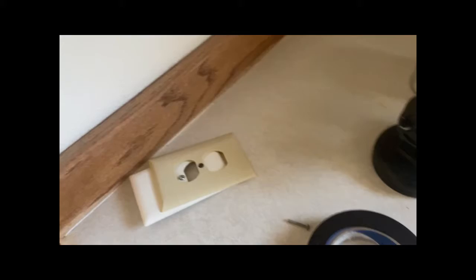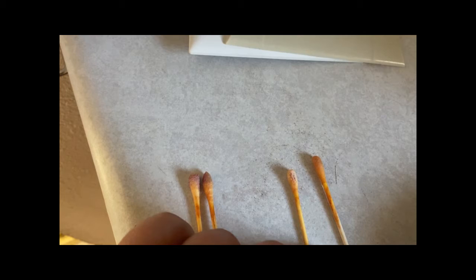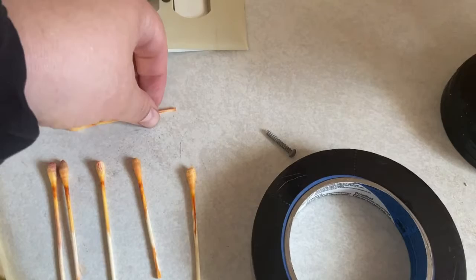This one here is the door jamb — maybe I think it looks okay. These are the two windowsills. This is the one I just did on the closet, and it's already starting to turn pink. This one still looks pretty yellow, maybe a little bit. I also wonder — there were smokers in this house before — so I wonder if this one is detecting lead from cigarette smoke, not actually in the paint.